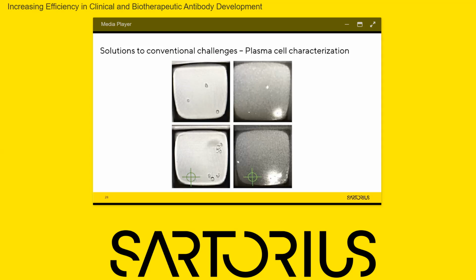So what you can see on the left-hand side is a couple of cells in the nanowell. And then if you compare that to the image on the right, you can see there's a large fluorescent signal in the top right, in the lower portion of that well, suggesting that this particular cell at the bottom is producing or secreting antibodies that are binding to the SIV-MAC.